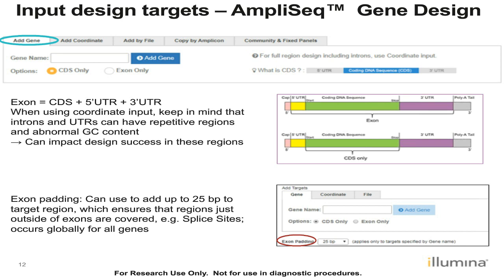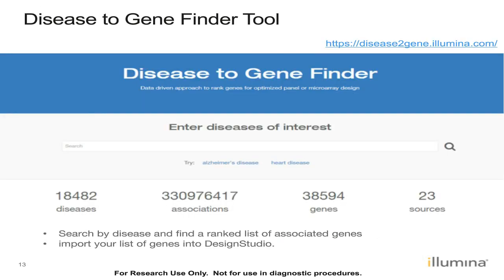A new tool on the Illumina website that is very useful is called the Disease to Gene Finder. Maybe you are trying to add genes but are not sure which genes to add. With this tool, you can search by disease of interest — for example, Alzheimer's disease, heart disease, or various cancers. The tool will release a ranked list of associated genes relevant for that particular disease. What is really useful is that you can then import that list of genes directly into Design Studio.